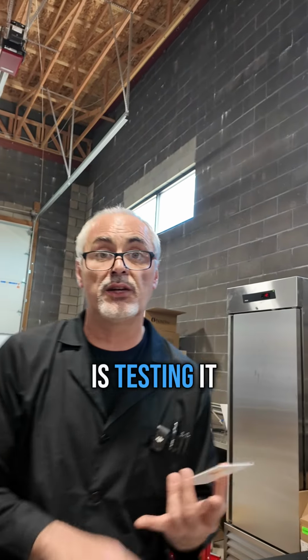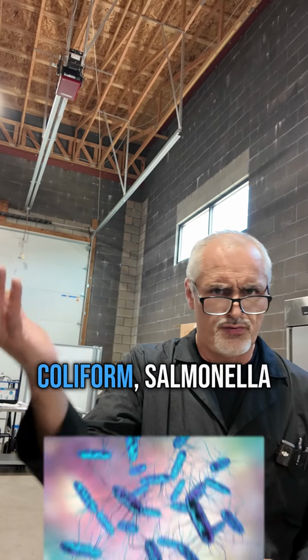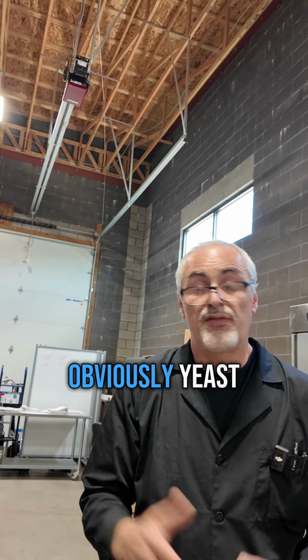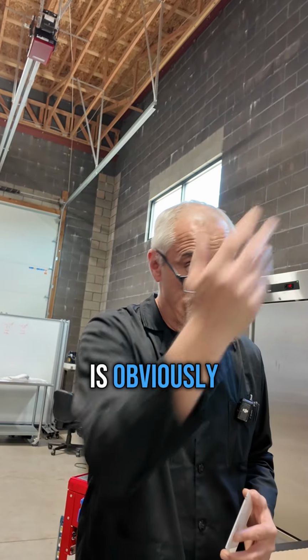The next level is testing it for the pathogens, the biological pathogens, which includes things like your coliform, salmonella, E. coli, and obviously yeast and mold, critical ones, amongst other things. The next test is obviously heavy metals.